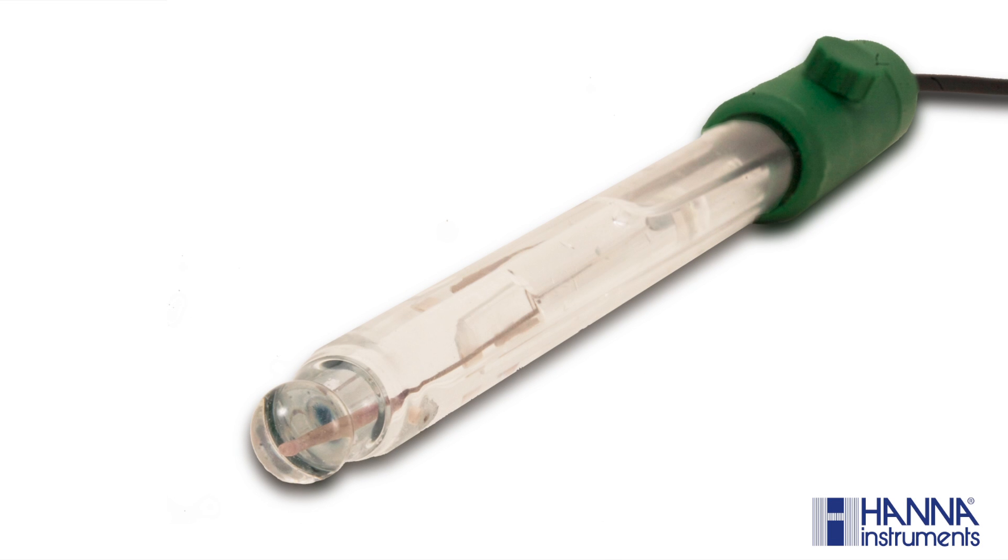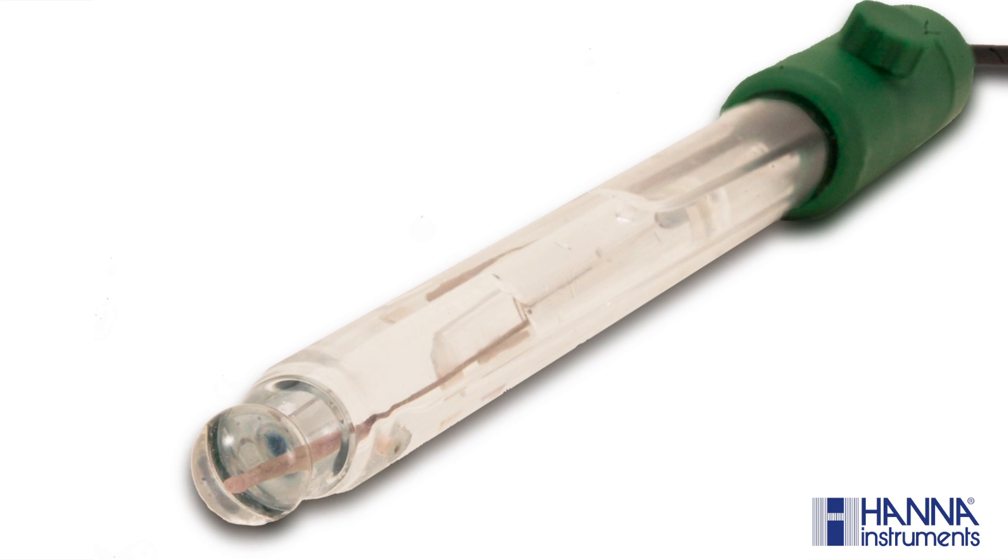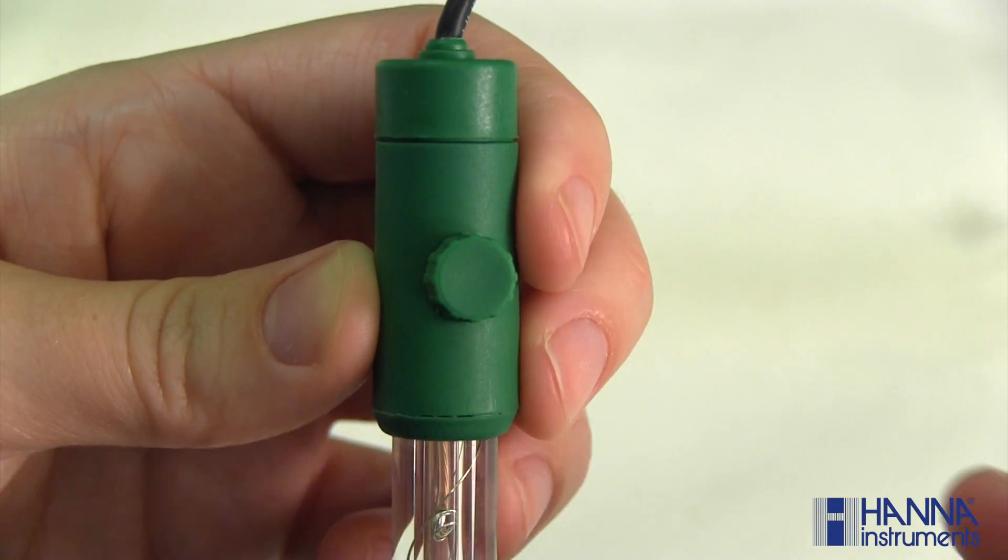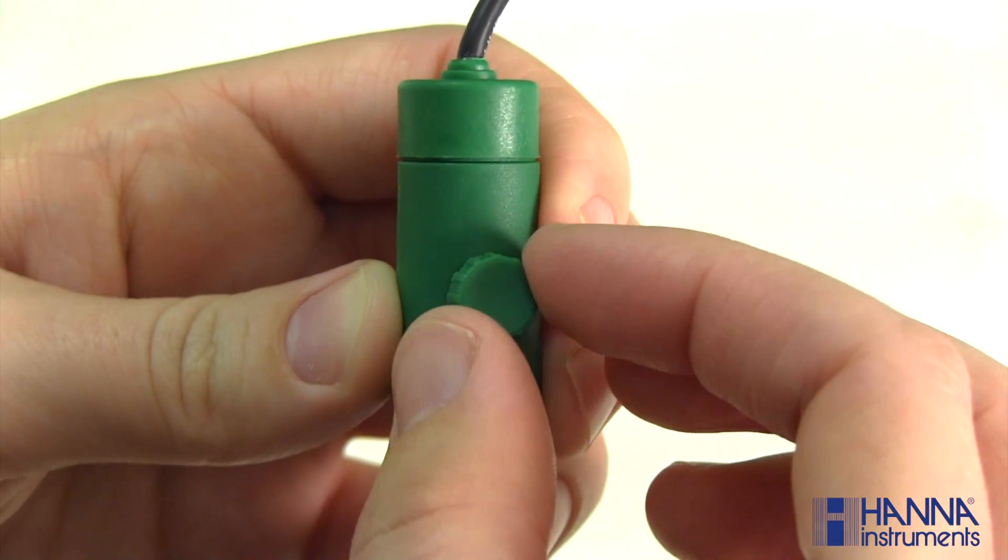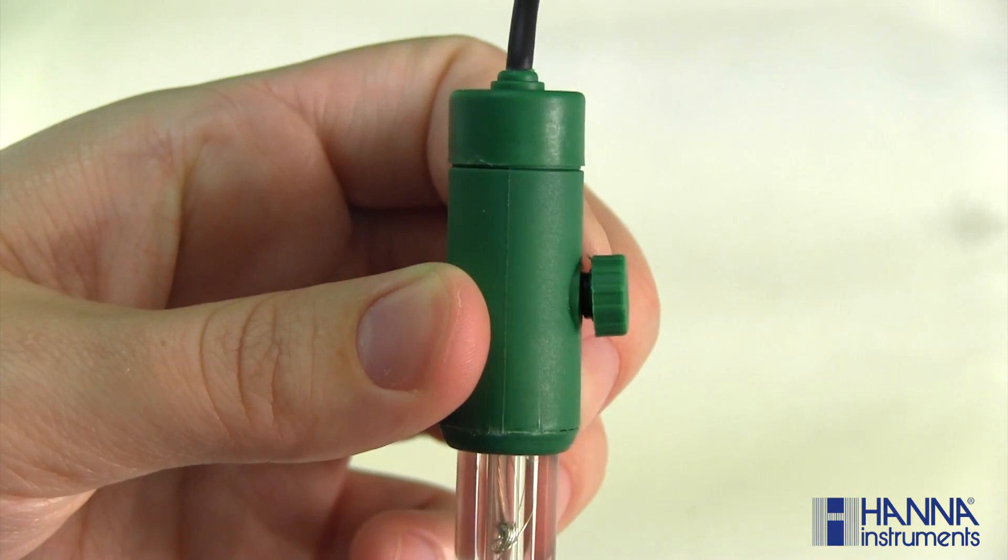Hanna Instruments supplies liquid filled electrodes with their benchtop pH meters. One of the crucial steps in producing accurate and reliable readings with these electrodes is to make sure the reference fill hole is open while taking a measurement.